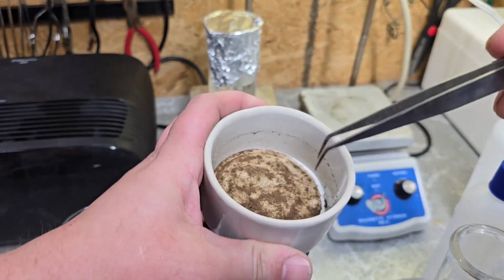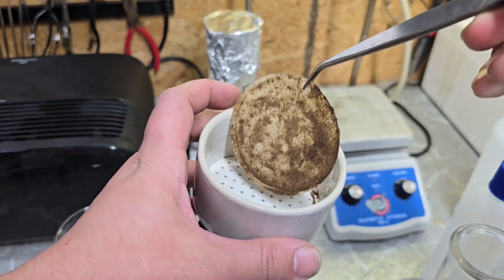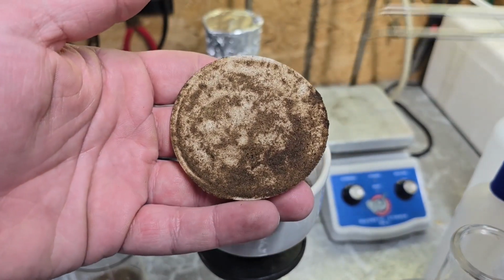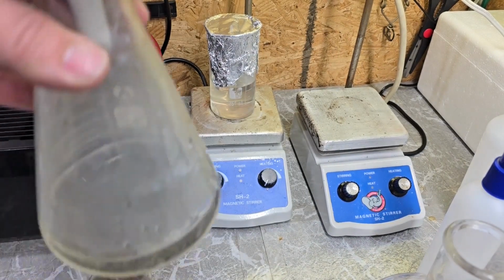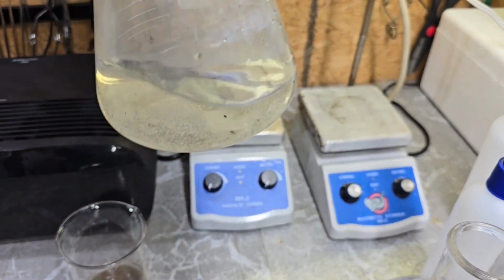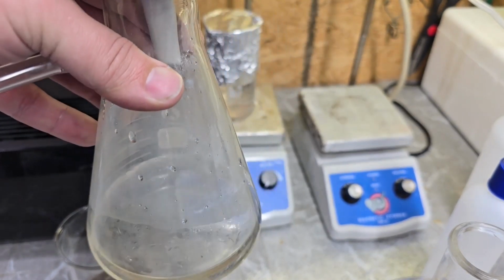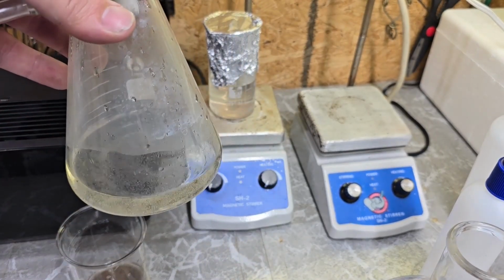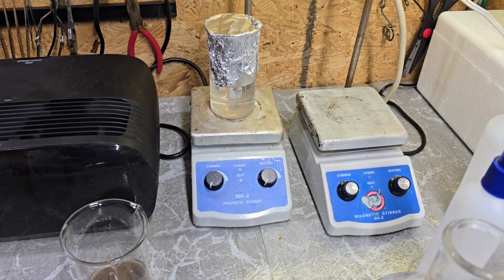Now I have a nice layer of soil and detritus, and if we're lucky, some tardigrades, maybe some amoebas, nematodes, and whatever. Let me move this filter funnel. That actually did a pretty good job of keeping stuff out of the water. Most of that stuff that you see floating around the water is just from whenever I poured. I tried to do this earlier without the vacuum, and it just went down underneath the filter paper, so that's why I decided just to use the vacuum after all, which I didn't really want to, but whatever.